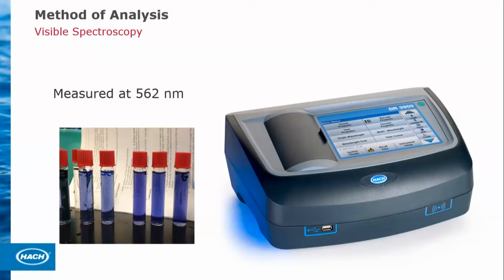If you're just grabbing a sample and looking at dissolved, you're missing most of your corrosion product. As recently as last week, I was at a facility having this discussion. They were doing this analysis. They've been doing it for years, and they were not doing a digestion. So again, we repeat this over and over and over again because there are facilities not doing it properly, and they're getting a false sense of security.